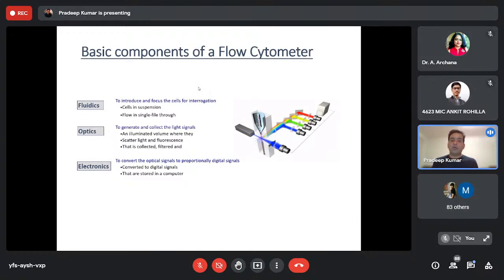Now, all the signals are going through particular cables, like fiber optic cables, which are used to transfer photons of different wavelength from one point to another as a medium of communication. They may be carrying one type of wavelength, or different types of wavelength. So to segregate different wavelength signals, different kinds of optical filters are used, like the green filter and red filter in microscopy, or filters of a particular wavelength which can transmit only that particular wavelength of light.